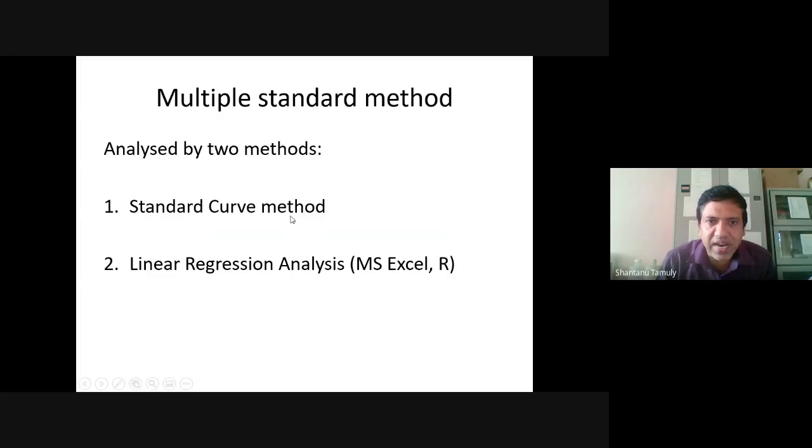Number one is the standard curve method. Number two is linear regression analysis. That can be done either in MS Excel or in the R software. So today I will demonstrate in both MS Excel as well as in the R software. We first discuss the standard curve method.